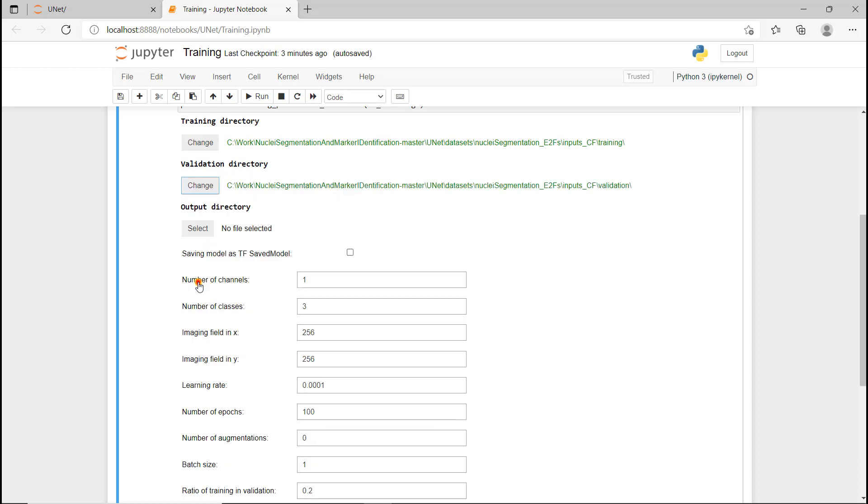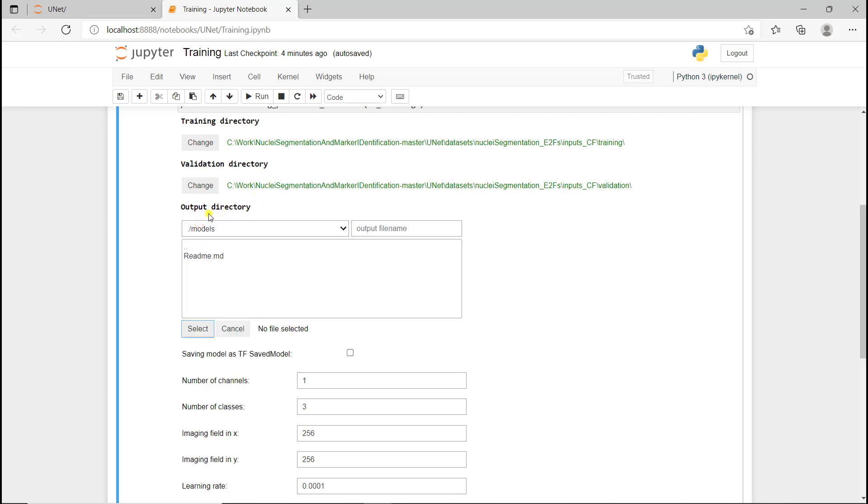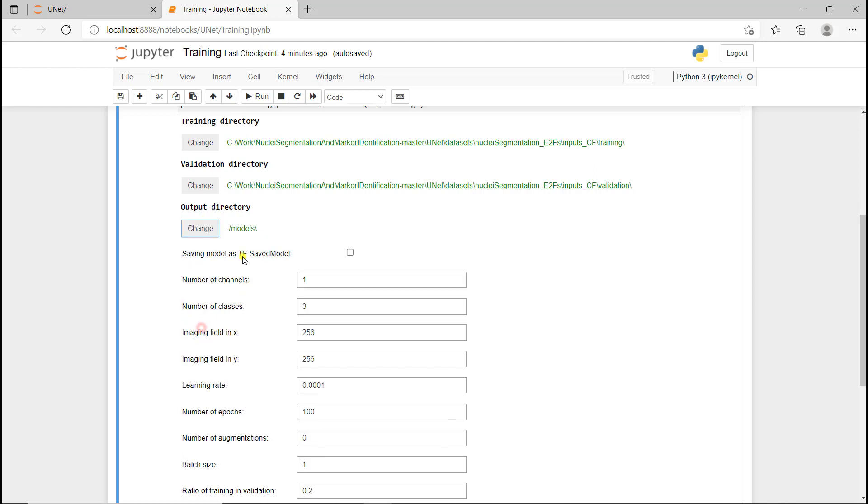Next we need to define the folder we're going to save the model we're going to train. When we click on select, we're directly in the models directory, and that's where we want to save it. I'm just going to select this folder. The next parameter: we're not going to use it, but it can be convenient. When we check this box, we're going to also save a TensorFlow SavedModel, and that can be convenient because within Fiji, if you download the CSBDeep plugin, it allows you to run a TensorFlow SavedModel.